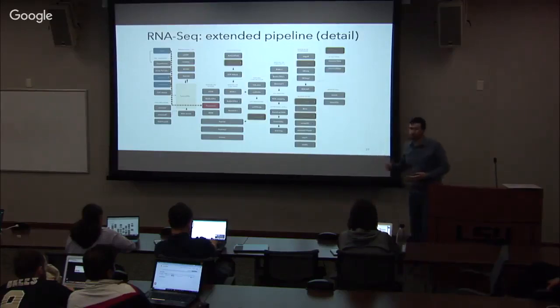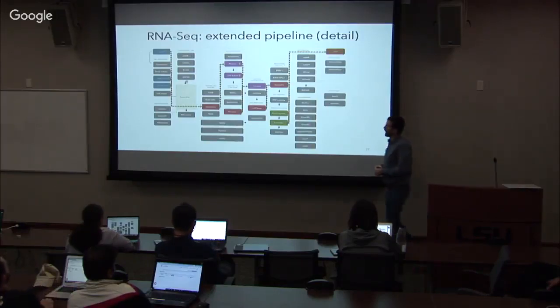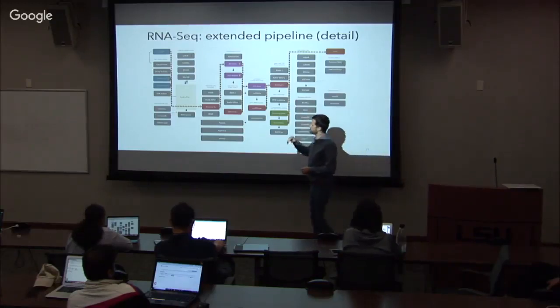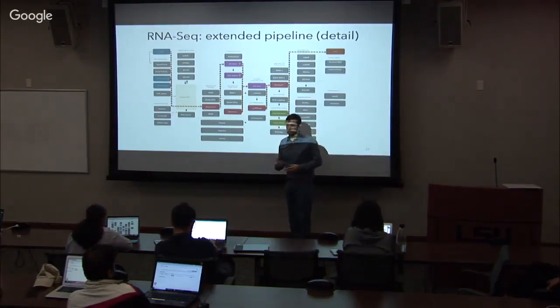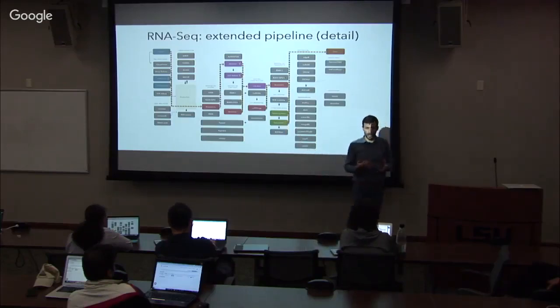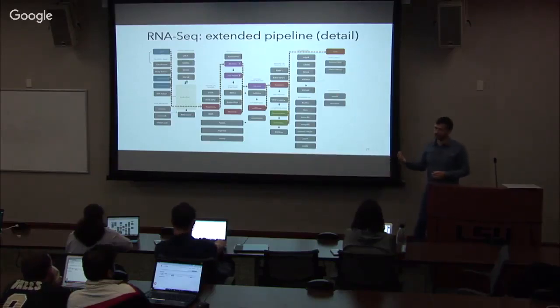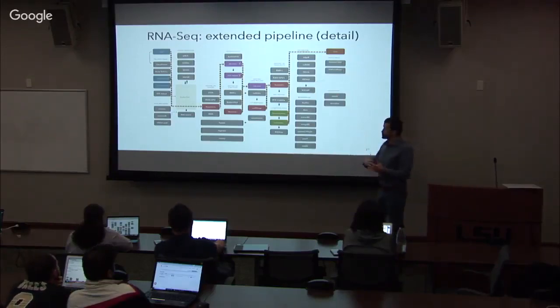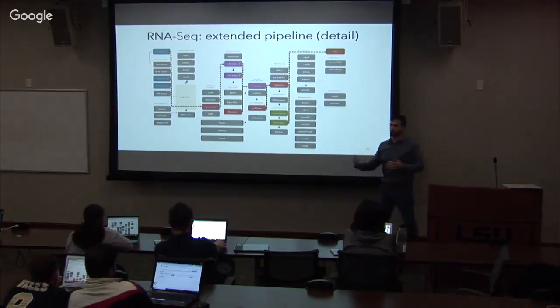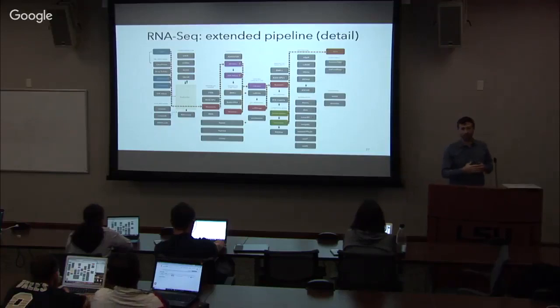And then from there, you can creatively analyze the data yourself. For example, in the following way. You can identify new exons, create a new adjustment to the GTF, then map on junctions using Bowtie 2, and then create the construction of isoforms using IsoLasso, merge the adjusted GTF with the known GTF, and then go from there in the same path to actually align them and quantify them using our sample.